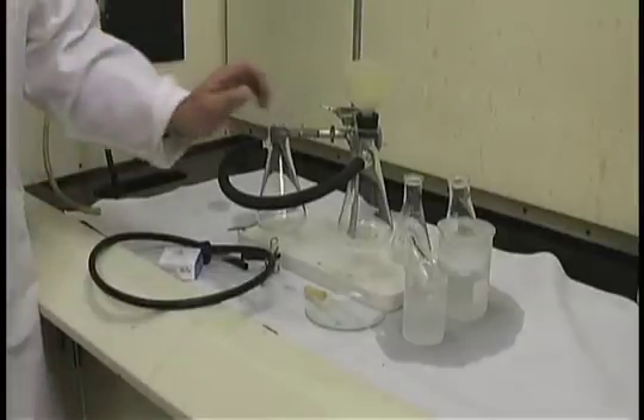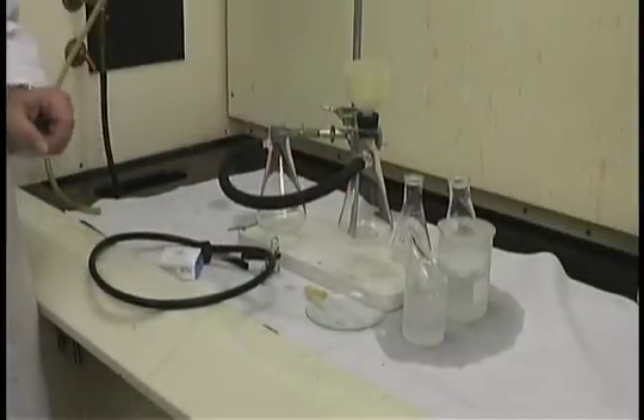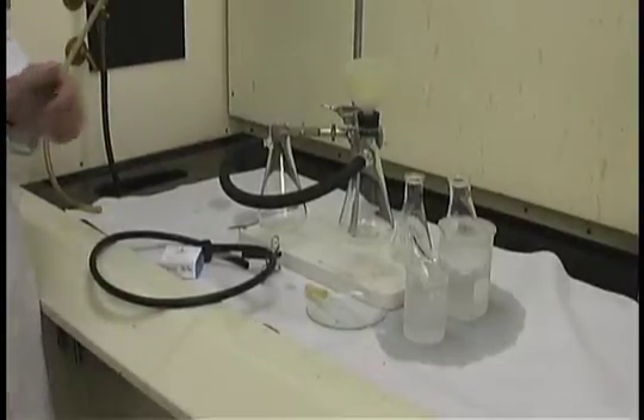Vacuum filtration using a Buechner funnel is a technique that's utilized to collect recrystallized solids that are typically more than 300 milligrams in amount.